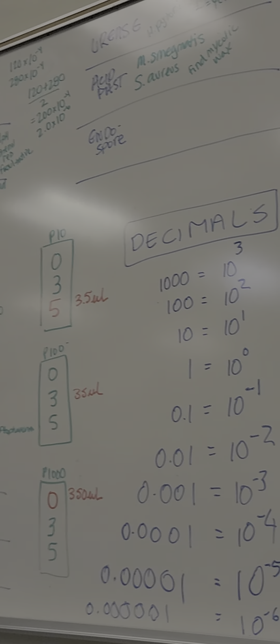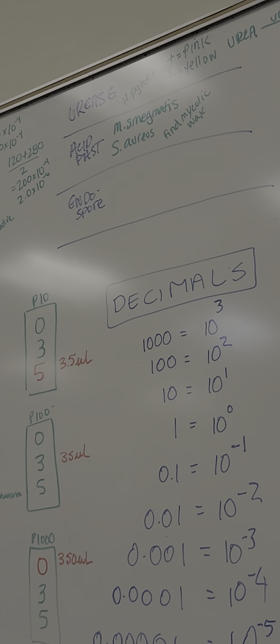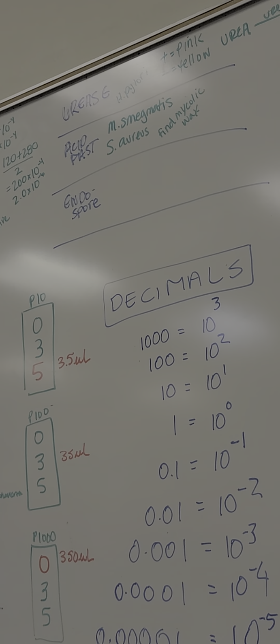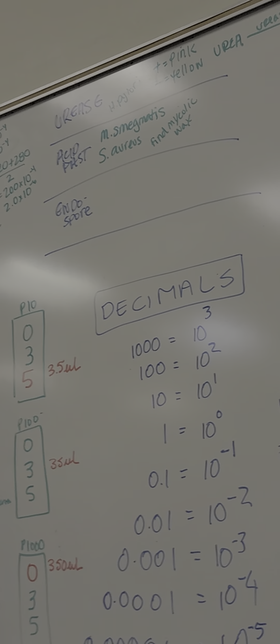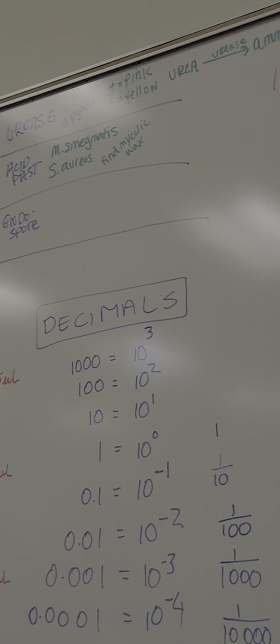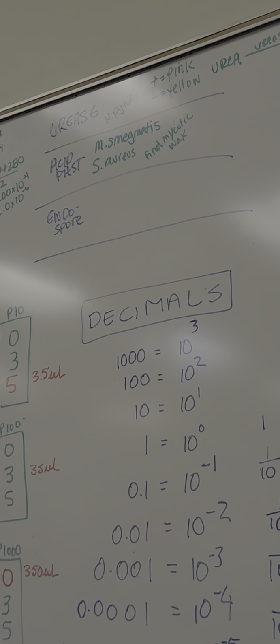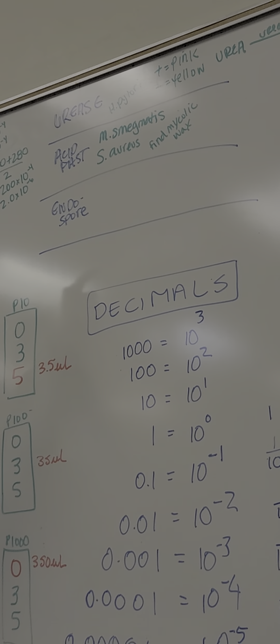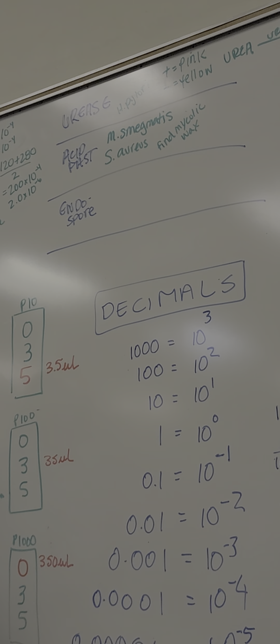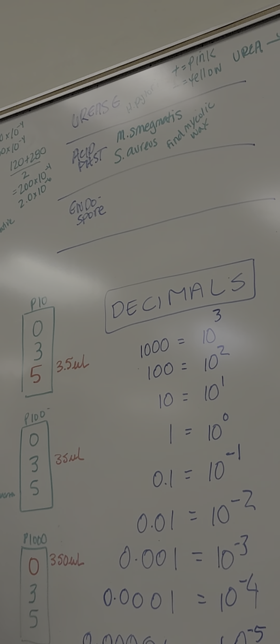So it's a stain to test for tuberculosis that a lot of people actually do in the field, that they can do it easily in the field and test for people. We don't test it in this lab, and you wouldn't unless you were absolutely certain that you could use all your proper PPE. But you don't want tuberculosis, obviously, so we use a different Mycobacterium organism.